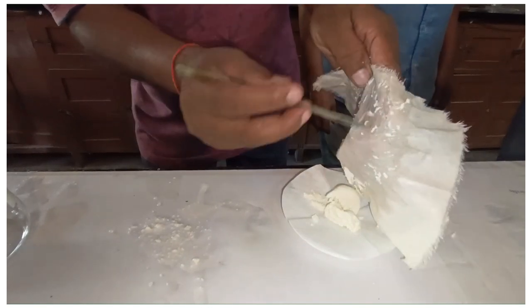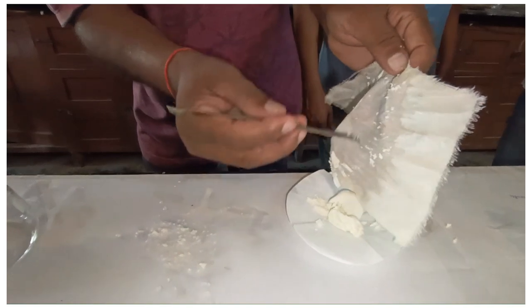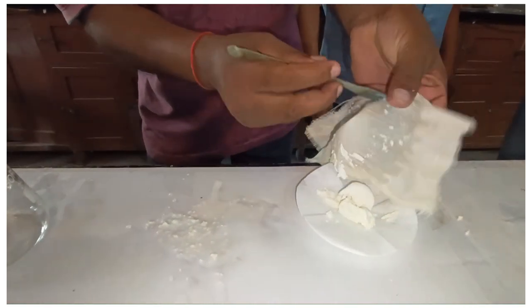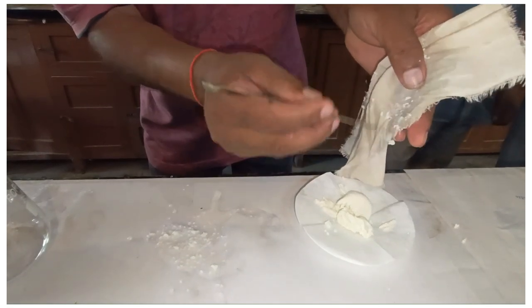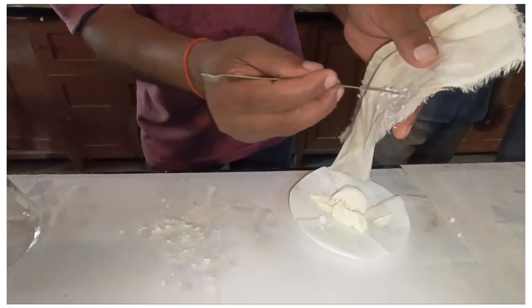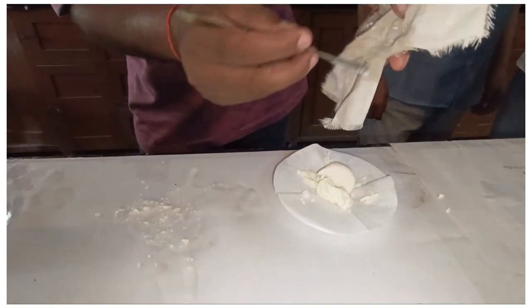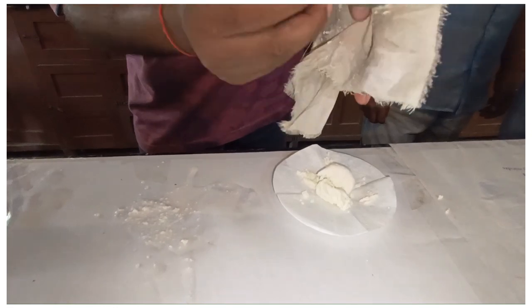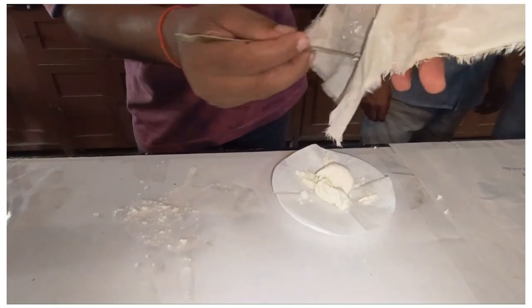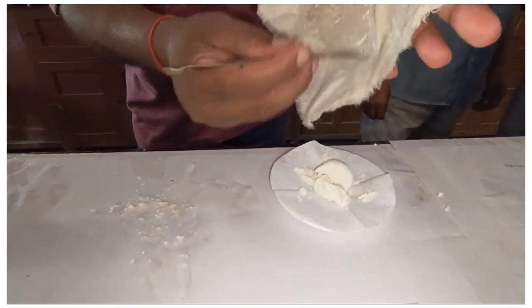This is the casein what we have collected from 100 ml of milk, and this is the required experiment what we have performed in the chemistry lab, on Sahitya Divas in the PG Department of Chemistry, Sahibganj College, with our UG and PG students, our sir Dharmender sir and other students present in the lab.